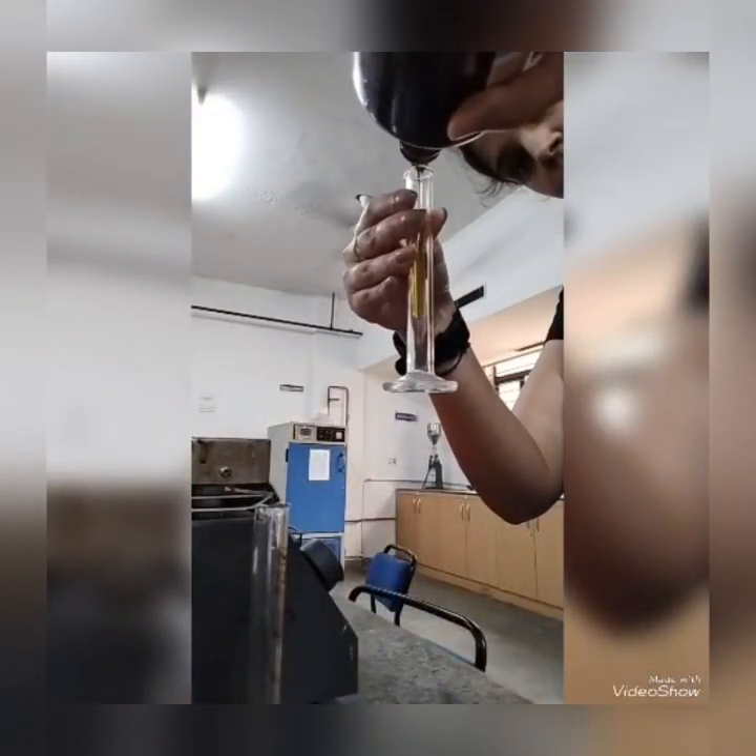The surfactants used are Span 80 and Tween 80. The surfactant was heated up to 80 degrees Celsius on a hot plate, and stearic acid was also melted on the hot plate.